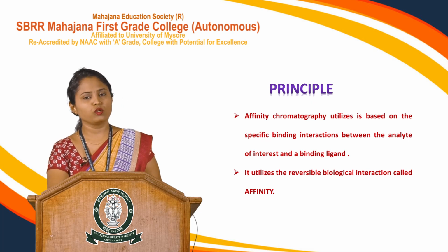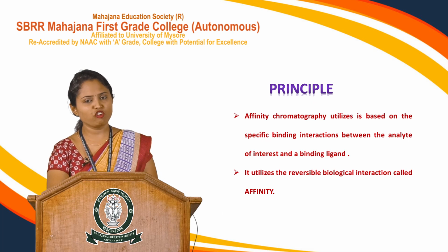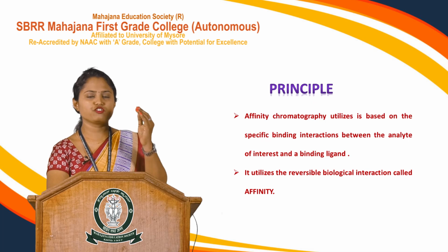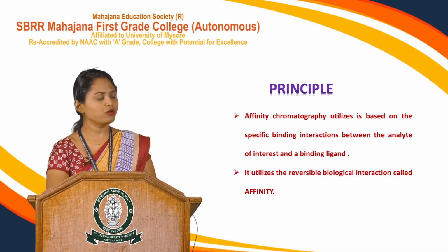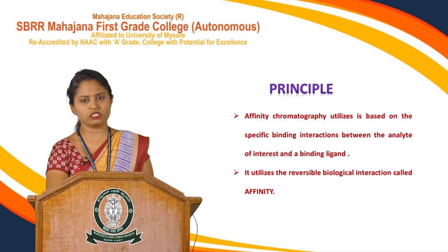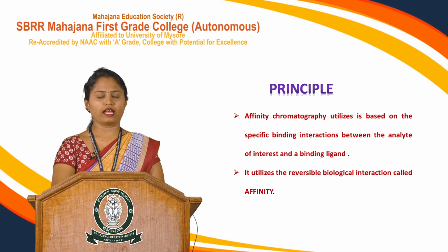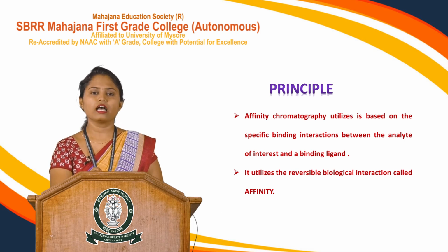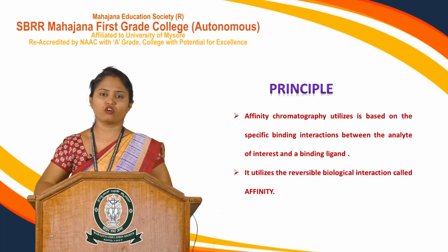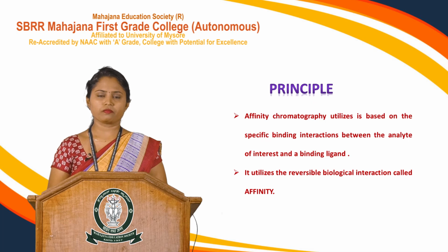So, based on that you can analyze the compounds of a mixture when you subject it to affinity chromatography. As they traverse through the column, the compounds that have very high specificity for your ligands bind with the ligands and remain in the column for a longer duration, until you elute or separate them from the bound position later.